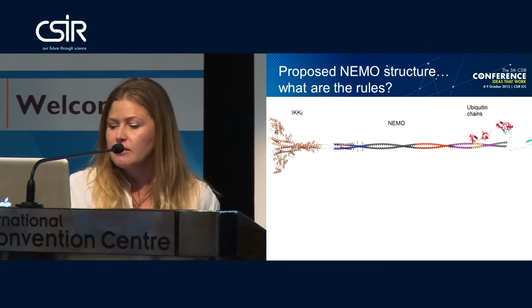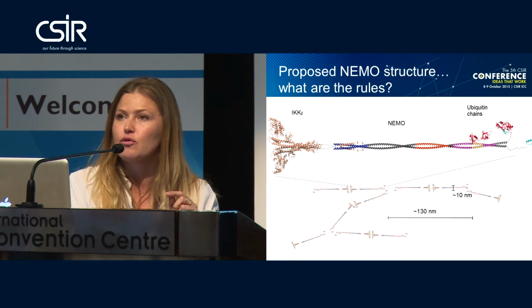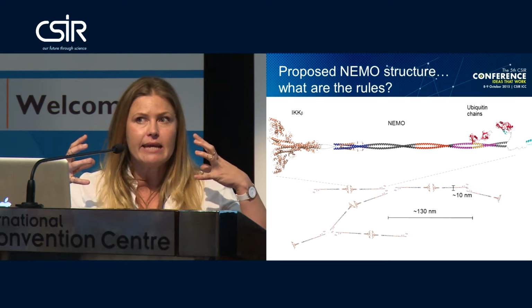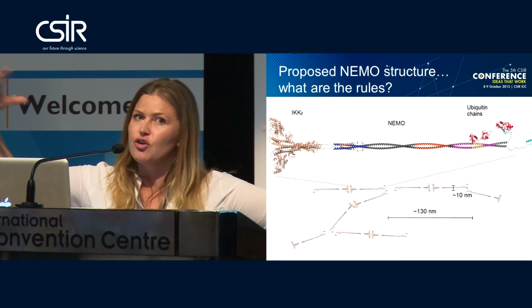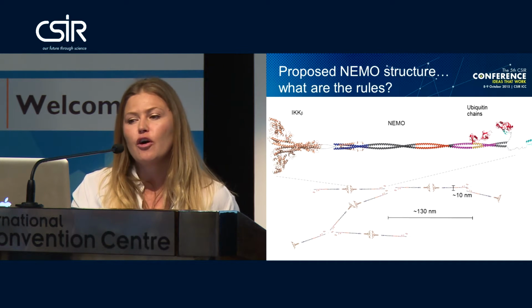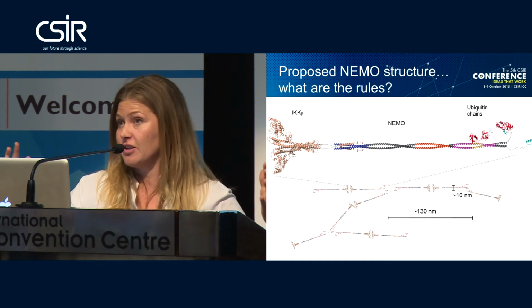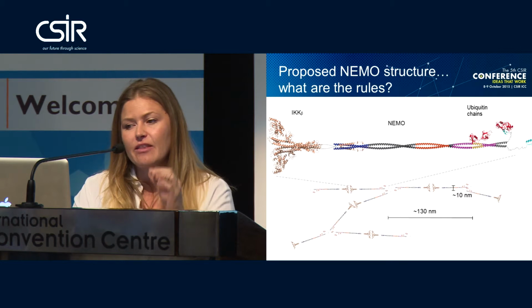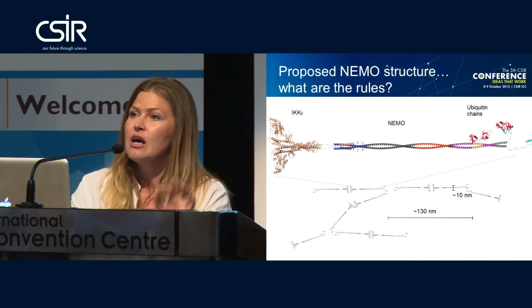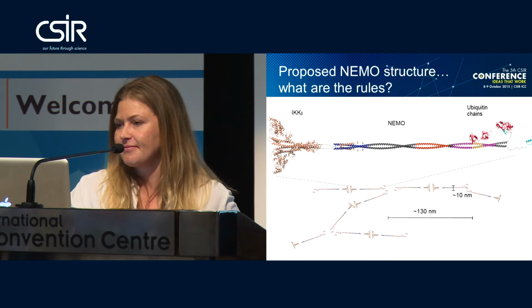If you play around in Adobe Illustrator a little bit, you can start joining them together based on those rules. And you can see that you can very easily start creating, hypothetically, a lattice structure of open-ended size. What's important, and this is critical, is that though this lattice could extend in microns, which is above the diffraction limit of light, because it is held together by these very delicate bridges that are below the diffraction limit of light, the only way we could possibly visualize this is with super resolution.